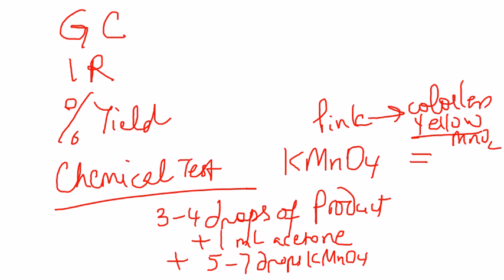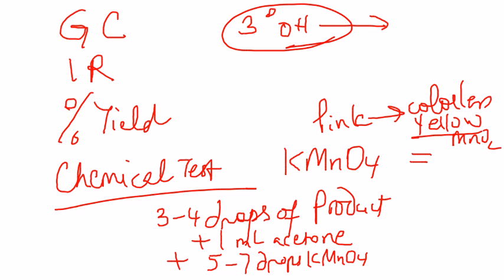Your starting material is a tertiary alcohol, and tertiary alcohols do not undergo oxidation. We'll learn about that in chapter 17. So this is a great technique to run the reaction for the case of the product as well as your reactant, and see for the identical conditions which one has a persisting pink color of the KMnO4 and which one goes colorless, and then discuss that in your conclusion section.